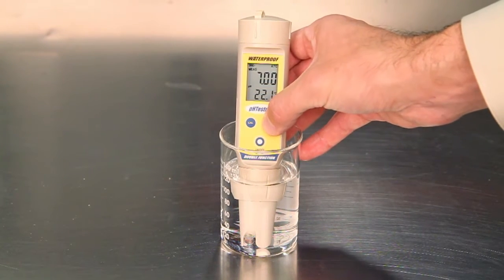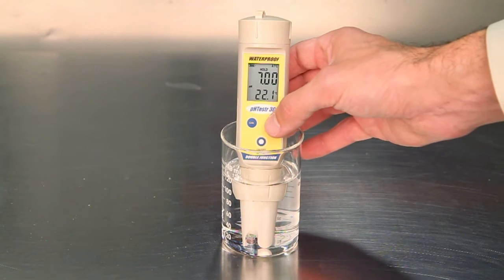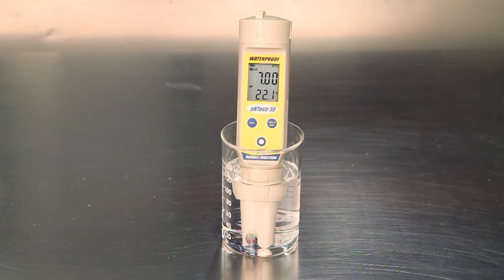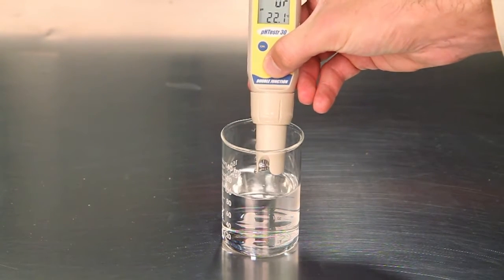Take note of the pH value, or press the hold enter button to freeze the reading on the screen. The temperature of the sample is also given on the lower display. Press hold enter again to release the reading. Press the on-off button to turn the meter off.